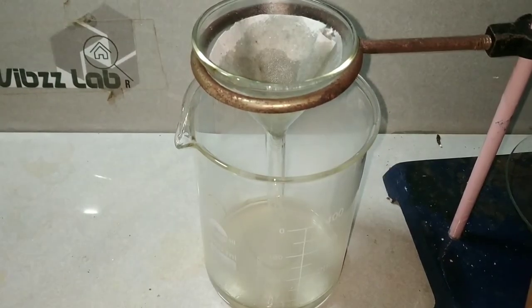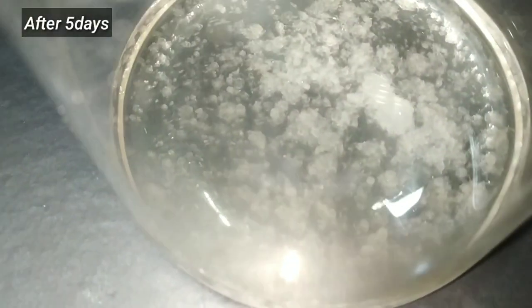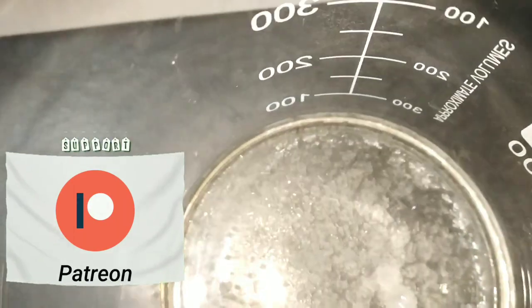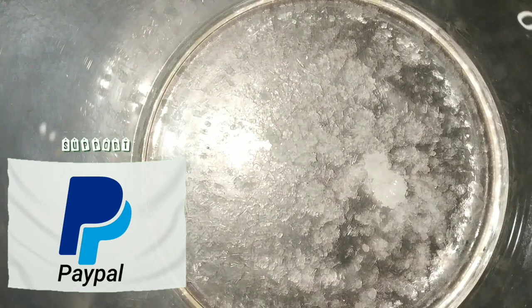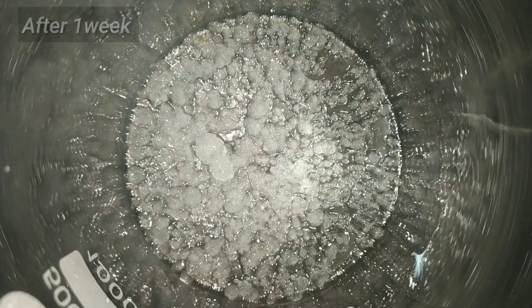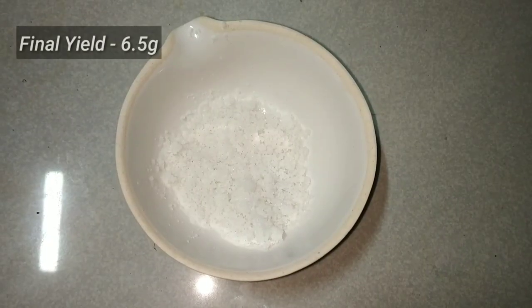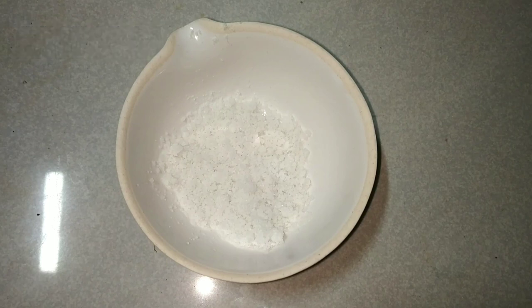After taking the filtrate, we keep it undisturbed for slow evaporation for a few days. After about 5 days you can see the crystals have started forming. These are the crystals which I obtained after 1 week. From the supernatant solution I boiled and recrystallized some more of the potassium sodium tartarate. Finally the crystals were dried and powdered, and the yield was about 6.5 grams.